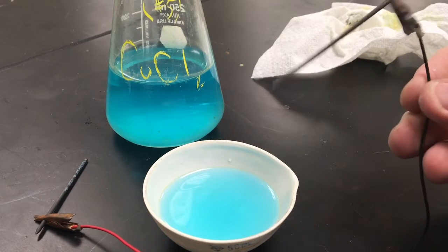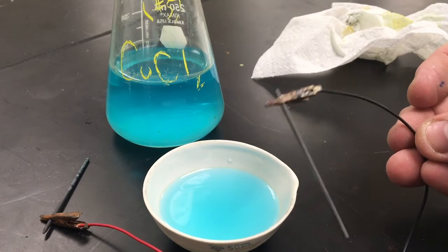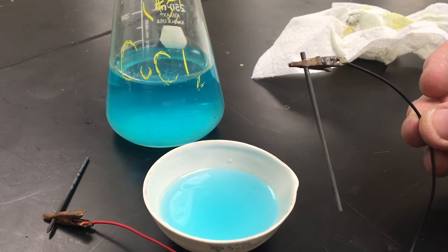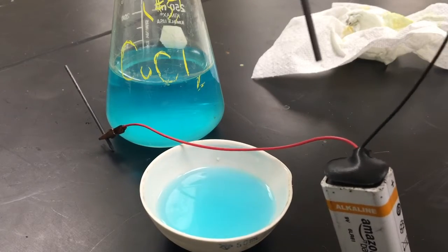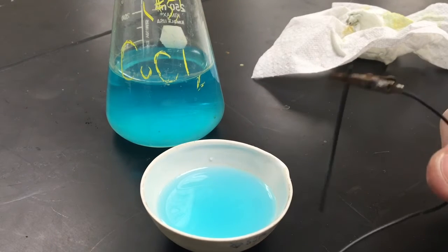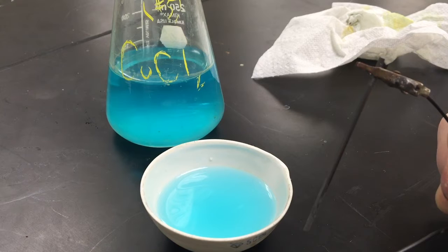And I mentioned in the instructions that this graphite that I'm using at the end of these electrodes, clamped into these wire clips, is inert. It's all made out of carbon and it is not going to react with the copper chloride. It's just going to help get the electricity from this battery into that solution. If I'd stuck that battery into the evaporating dish like what we did with our steel wool earlier, then the battery would get all wet and rusty and it'd actually become part of this reaction. So all this fancy stuff I'm doing with these wires and these electrodes is actually just to keep from having other stuff involved in this reaction.